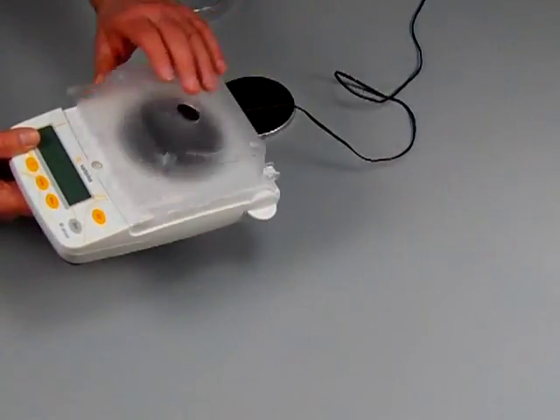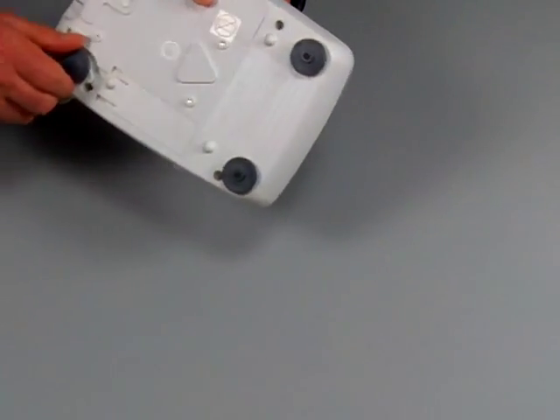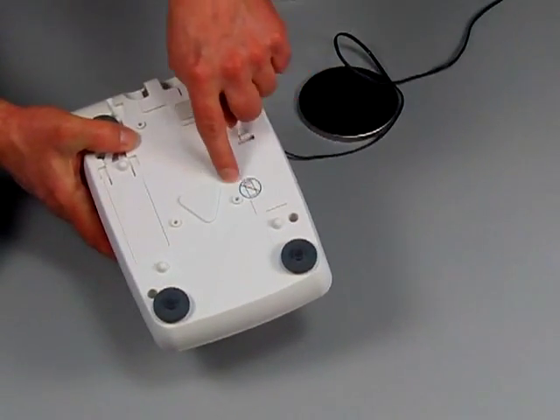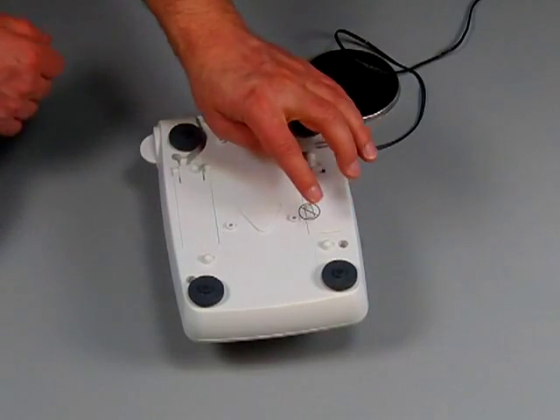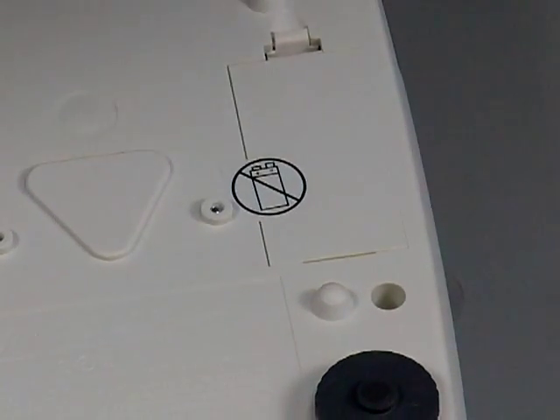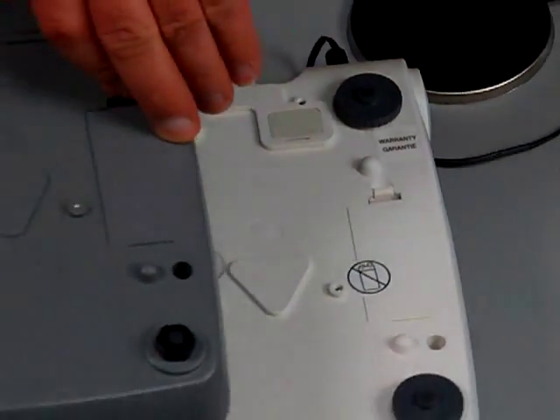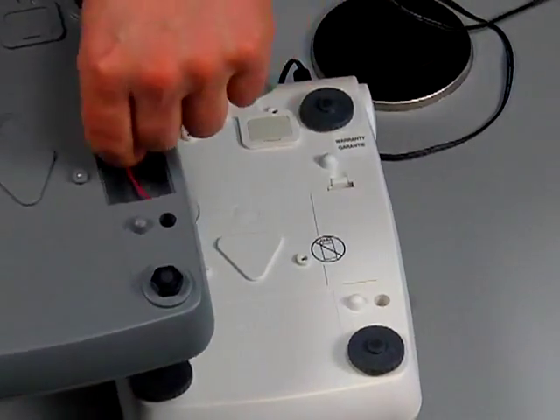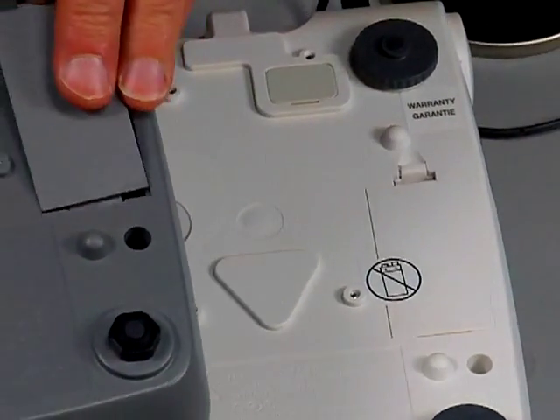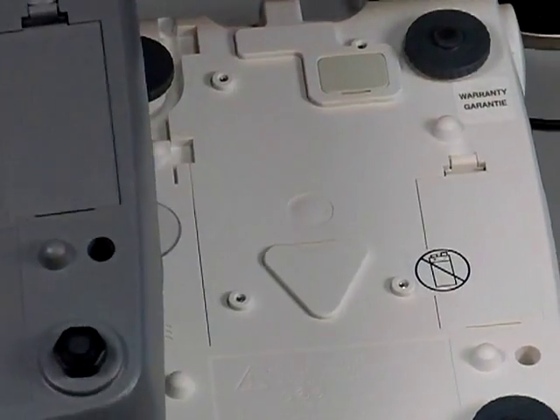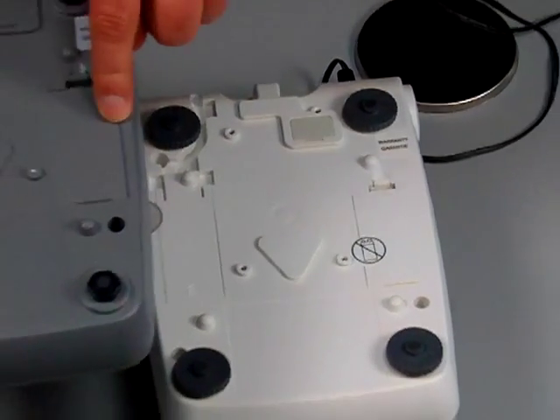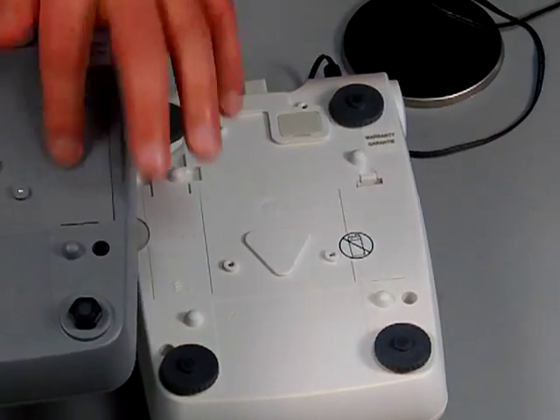The balance does have four adjustable feet, which are very nice. And you'll notice here, the battery compartment has a sticker on it because this scale cannot operate off of batteries. The milligram balances need to be plugged in. Versus on the balances that go to 0.01 gram and 1 gram, you have a 9 volt battery compartment. So again, be very careful which model you select because there's no battery on this guy. But if you go with a scale going to 0.01 gram or 1 gram, you do have a battery compartment.